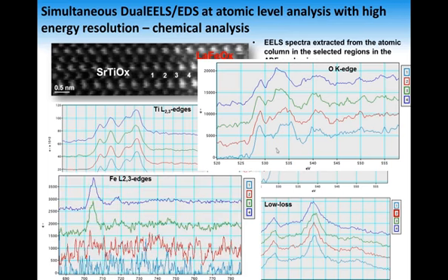But the most interesting information is what we get from the iron. If you look at iron in position 1 here, you'll see iron. Position 2, not much. Position 3, we see iron. This is again to show the high efficiency of EELS, and again the EELS signal is very localized in this case. So we don't see any iron in position 2.